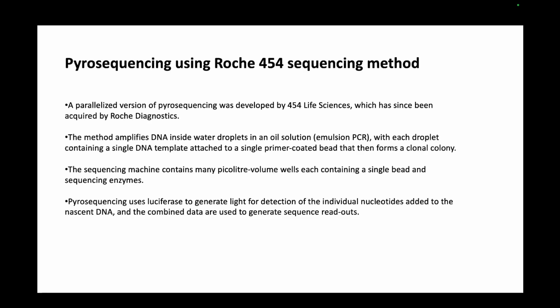The sequencing machine contains picoliter volume wells, very small wells, and each contains this single bead and a set of sequencing enzymes.